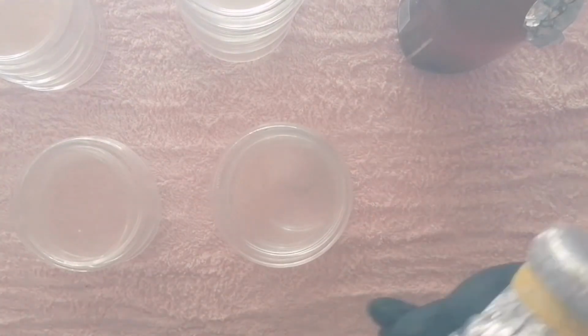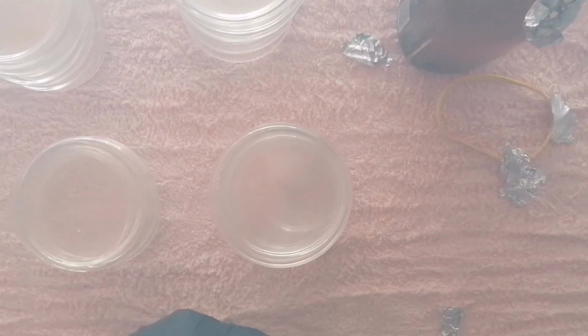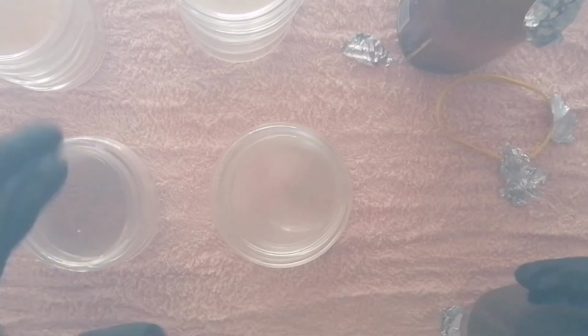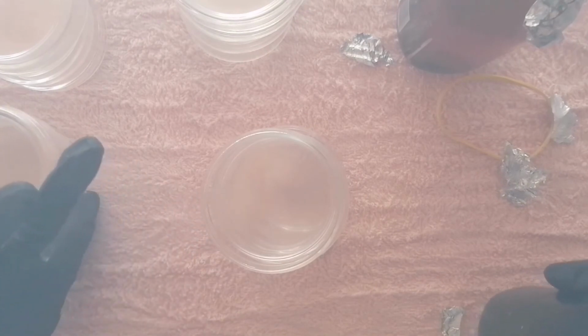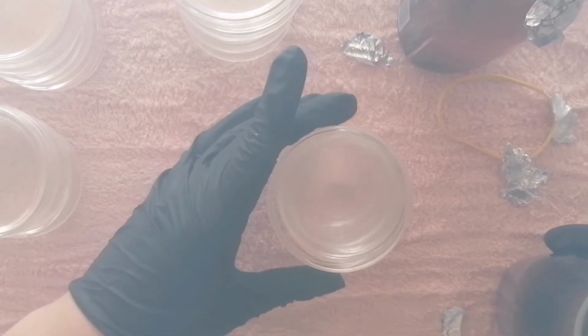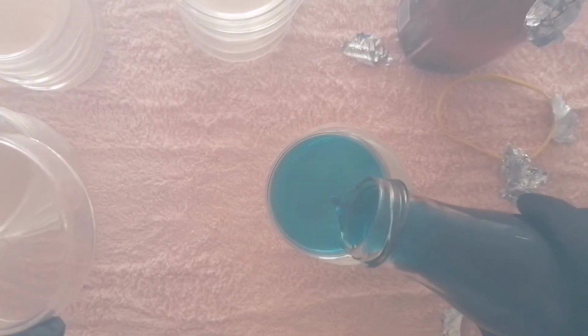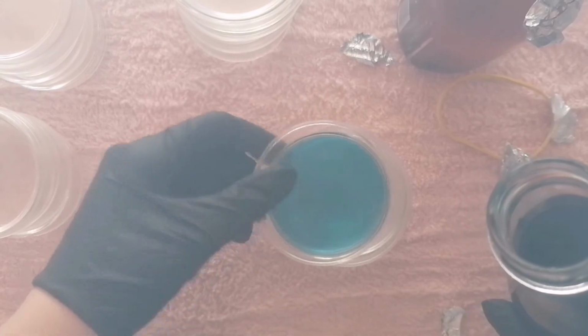Okay, so this is how I prefer to pour it. Well, first I make a few mistakes. But let me just open this. It takes forever all the time. So let's have a look. So first I make some mistakes. So here I'm just moving them so that they're nice and center. So I pour in the agar. I pour in sometimes a bit too much and I mess.